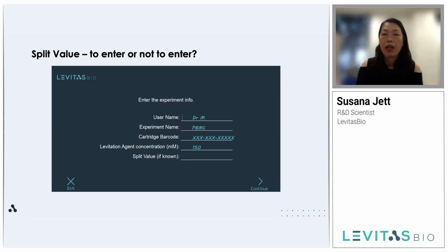At the end of the recommended equilibration time, you can choose to extend your levitation time and give the cells and objects in the cartridge longer to reach your final levitation height by leaving it alone. Just set a timer to keep track of how long your equilibration time was for future reference.